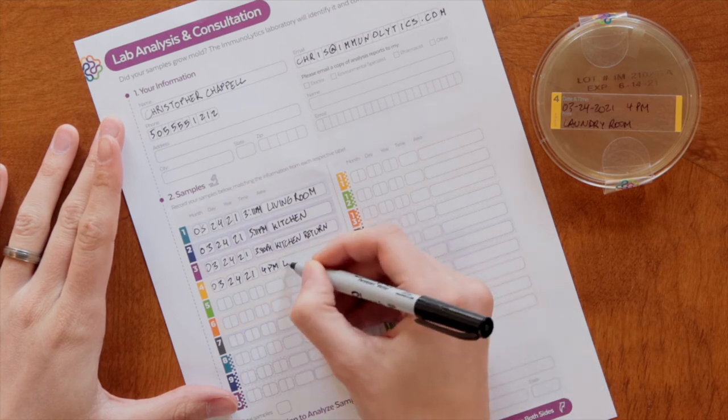For each visible mold sample taken with a swab, apply a label to an area of the container where it's most visible. Each sample label is numbered, so do your best to keep the sample labels in sequence without skipping numbers. After you're done closing and labeling the samples, record your samples on the lab analysis form, matching the information from each respective color matched label.